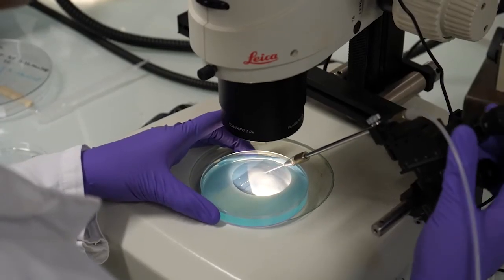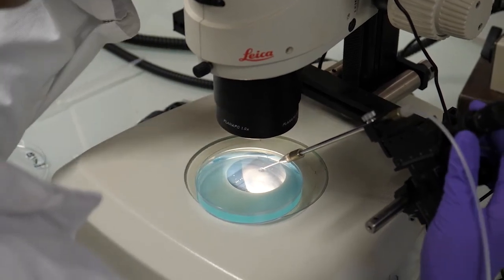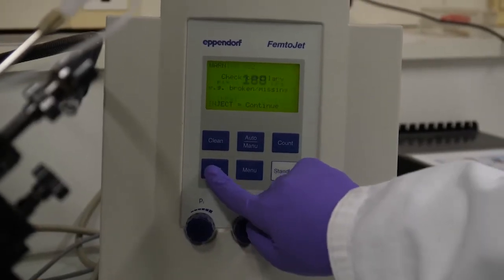Injection is done one by one into the center of the cell, either by pressing the inject button on the injector or using the pedal attached to the injector.